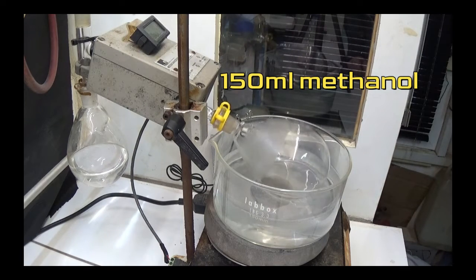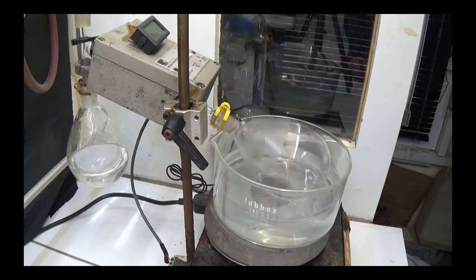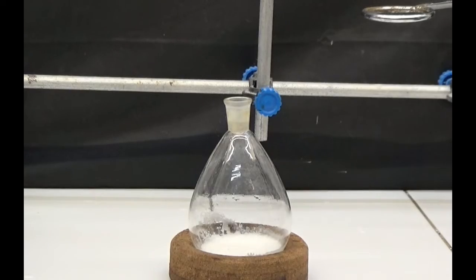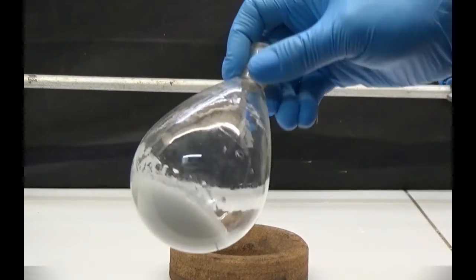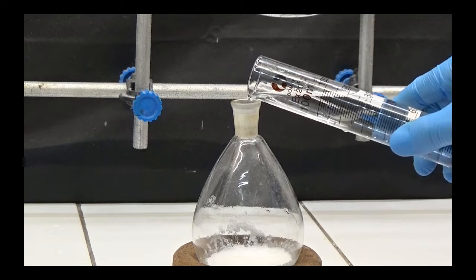We evaporate the methanol using vacuum distillation in a water bath to recover it. After all the methanol has evaporated, we allow it to rest so that the acid crystallizes.